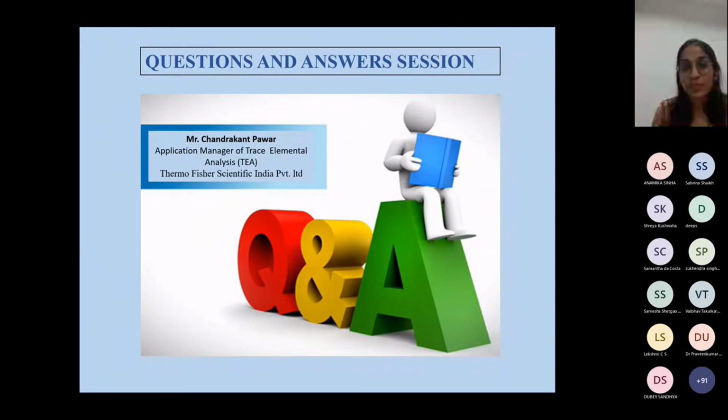Okay. Thank you, sir. So the other question is by Farah Ansari. He is saying that, sir, asphaltenes are complex insoluble precipitates extracted from crude oil. So what precautions do we need to take during its elemental analysis in order to maintain the homogeneity?